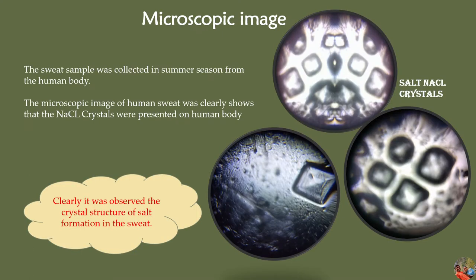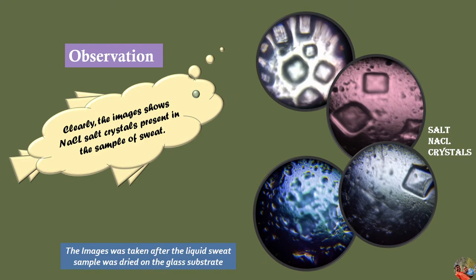This is the Microscopic image of the Sweat Sample. It shows that clearly the NaCl crystals, which are salt, can be visualized under Microscopy. This is one of the salt crystals. Four salt crystals can be seen in this particular image. There are many number of crystals in this image. By this we can understand sweat consists of salt material which is NaCl.